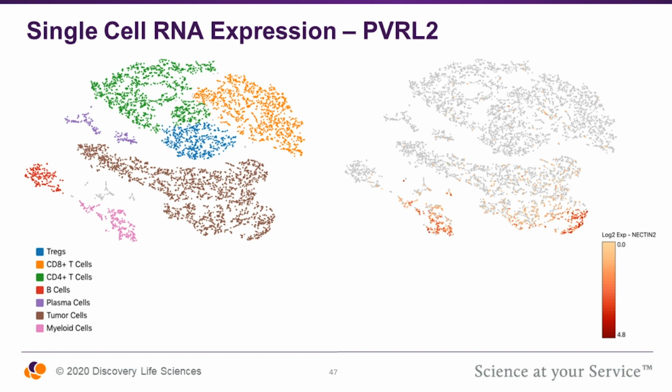So this data set really allows you to look at all of the co-stimulatory, co-inhibitory molecules rather than being restricted to just a few. This technology then can be used to either do barcoded antibodies in CITE-seq or go back to flow cytometry to have orthogonal assays to really evaluate this at the protein level.